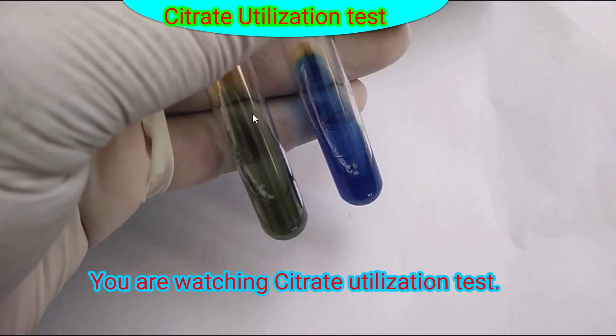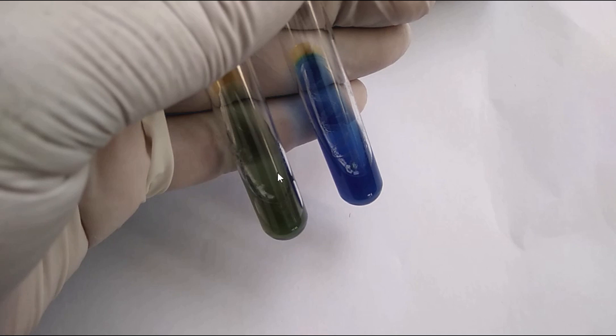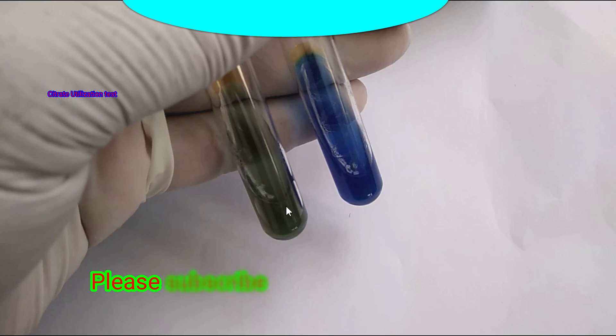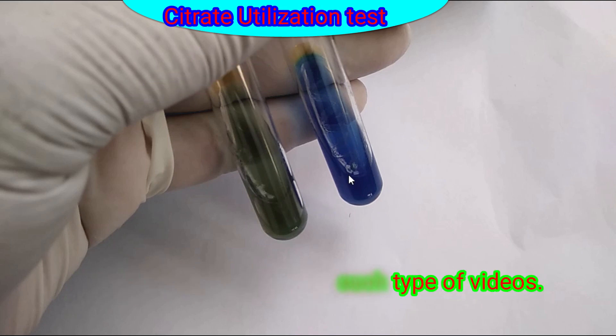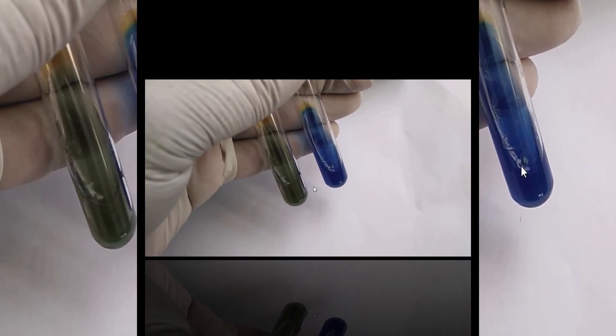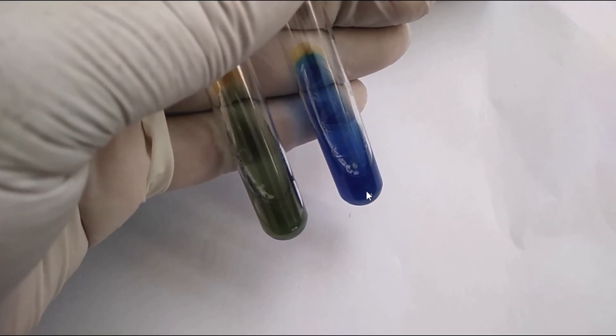This medium is Simmons citrate. The sole source of carbon is citrate, and the indicator is bromothymol blue. When the pH of the medium is shifted above 7.6, it changes from green to blue color, indicating a positive result.